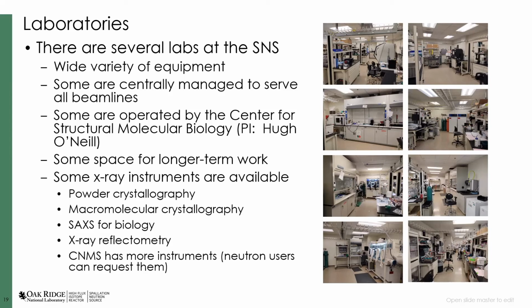We do also have some space for longer term work. So if what you're working on really requires you to spend considerable amount of time preparing your sample and is best done on site in preparation for your neutron experiment, we can work with you. We have some X-ray scattering instruments that are available to users. So powder crystallography, macromolecular crystallography, small angle X-ray scattering for biology, X-ray reflectometry.